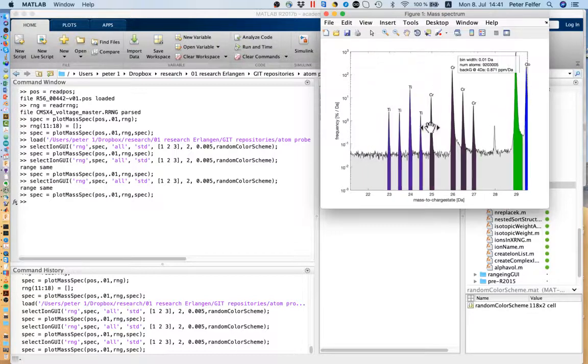And the other thing is not a bug really, it's behavior that's not been implemented yet, and that behavior is that, if you have complex ions, you can have different isotopic combinations that have the same mass to charge, or that just weigh the same. Just imagine, I don't know if those isotopes really exist, but just imagine you've got iron 56 and iron 57 and carbon 12 and carbon 13.